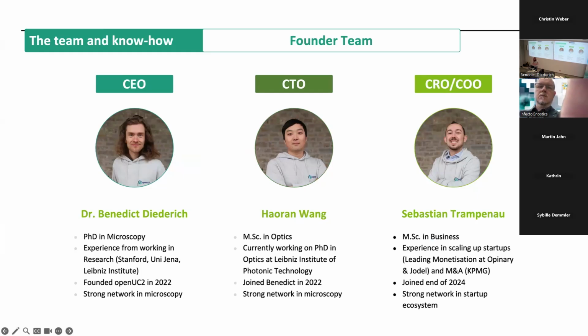And so the agenda for today is having fun. That's the first place. So we have two boxes here. Maybe we can put them here. Then you don't need that hard. And the boxes, they come with an open source OpenUC2, which I must admit is not perfect yet. There's also a little bit of story behind it.